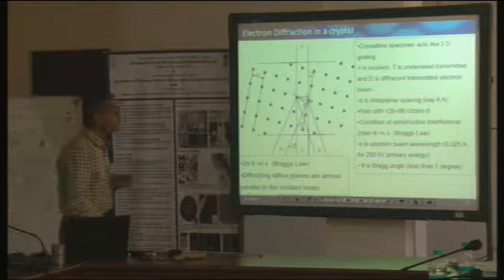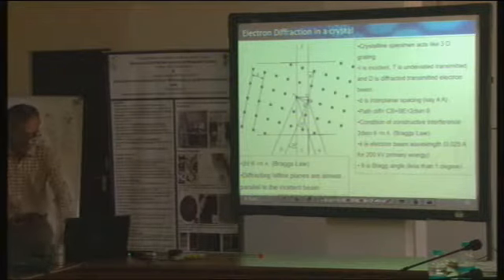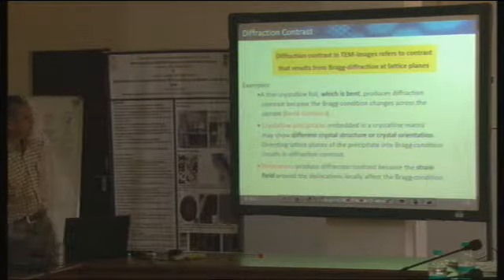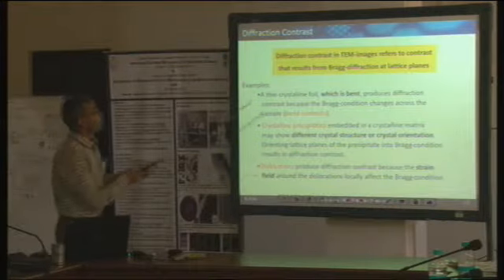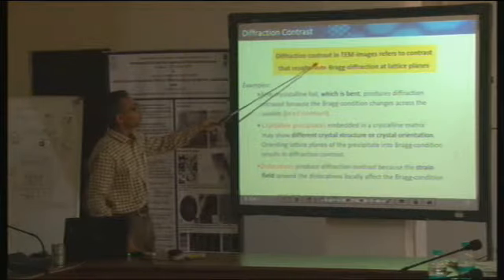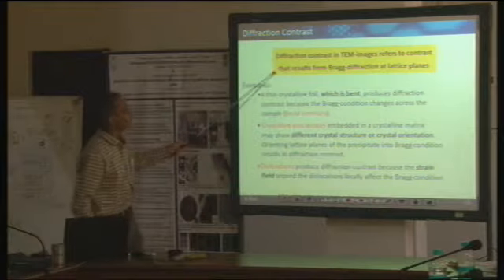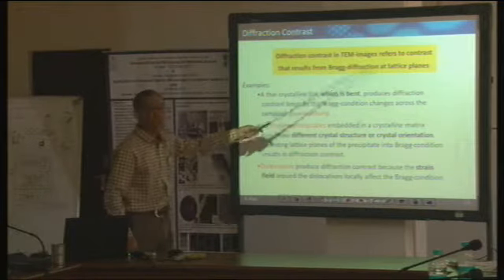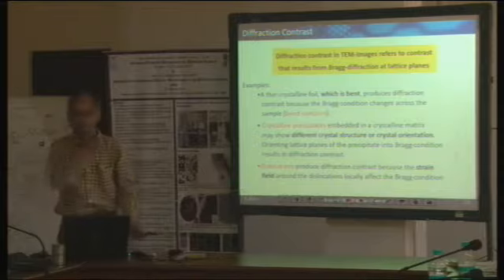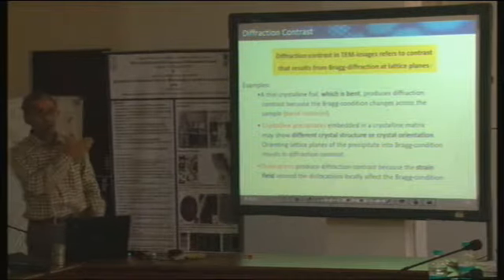Okay. I think this part is clear, and we now go ahead. So diffraction contrast in EM images refers to contrast that results from Bragg diffraction at lattice planes. Okay, this is fine, but this will not allow you to study defects.